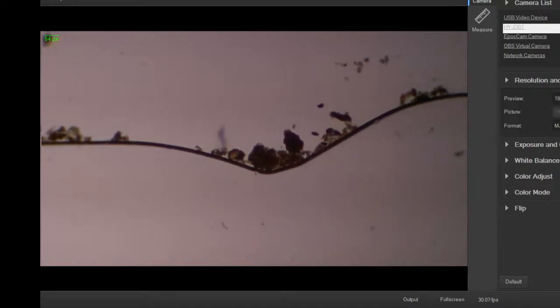It's fun. I mean, they need more presets, but I try to vary the mixer once in a while to make it a little more fresh. But there's some really good stuff on the stream earlier. Lots of different ciliates collecting around clusters of debris.